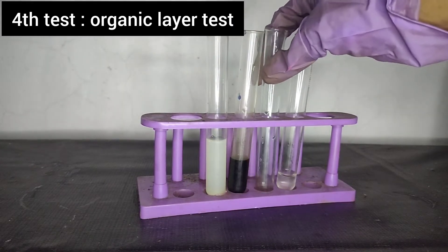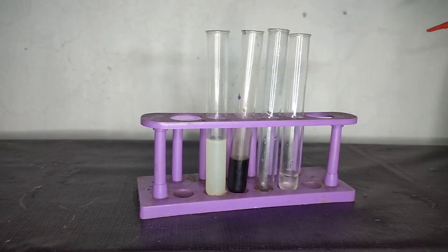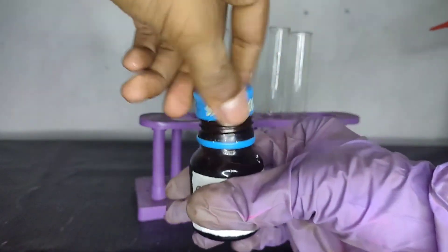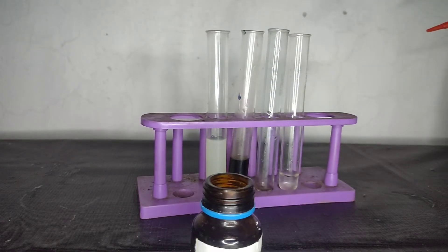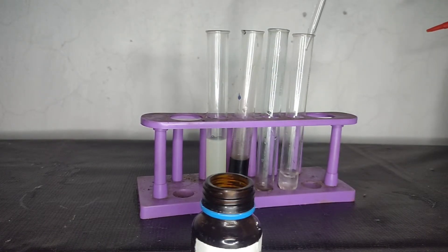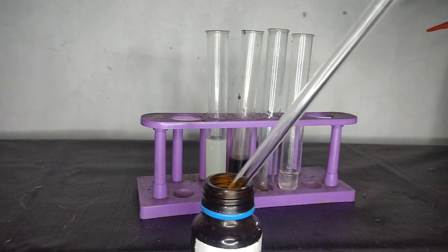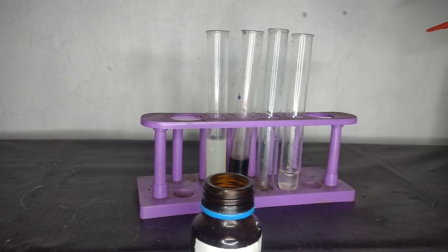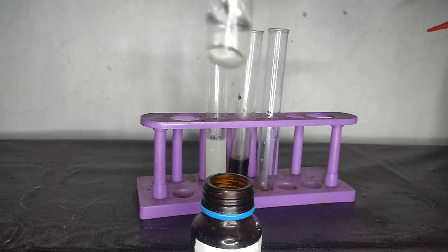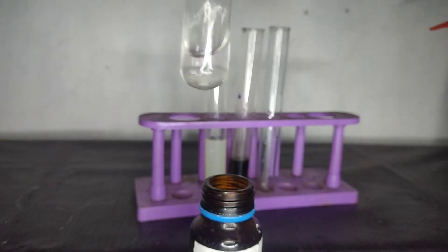The final test or the fourth test is the organic layer test, and this is my favorite among all these tests. So for that, you need soda extract. Now to this, we need to add an organic solvent such as chloroform or carbon tetrachloride. You can see that the chloroform sinks to the bottom and forms a separate organic layer below the solution.